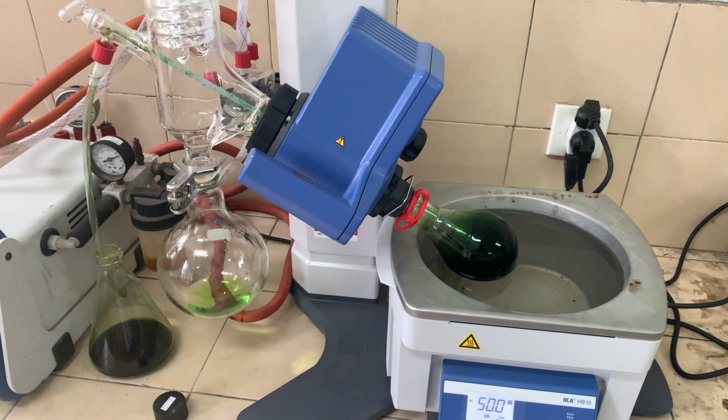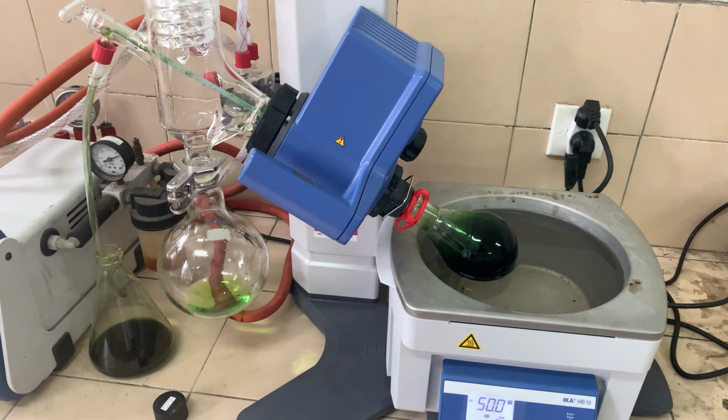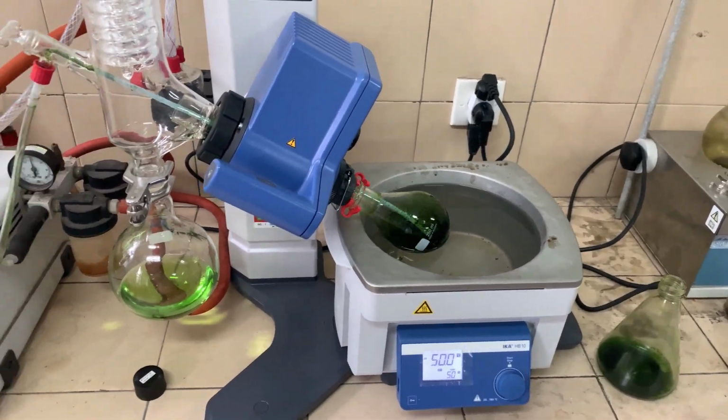Then the sample is processed with a vacuum rotary evaporator. Evaporation with the rotary evaporator is stopped until a sufficiently concentrated extract is obtained.